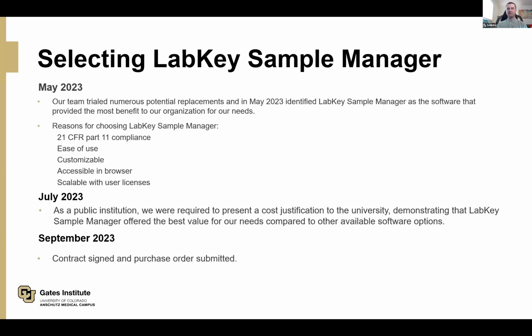So being accessible in browser allowed our operators to access this system from home, or if they're just working remotely, to look up those samples and pull those reports. So these operators didn't have to come on site or go to a specific room within our facility.